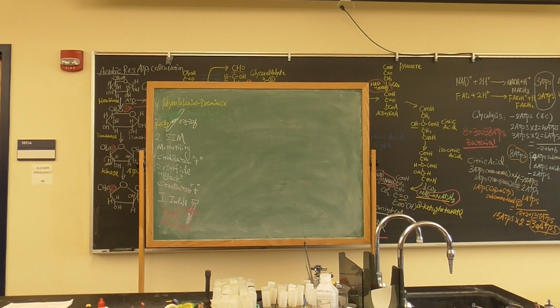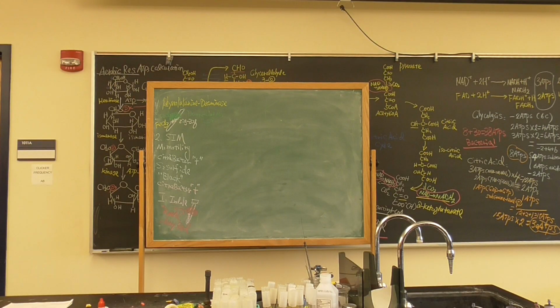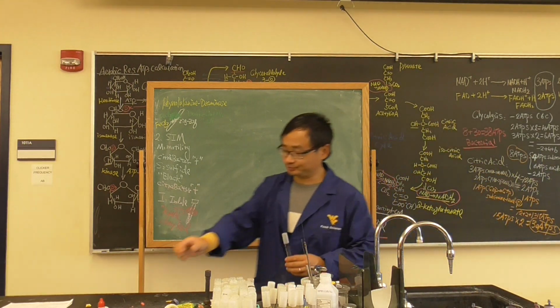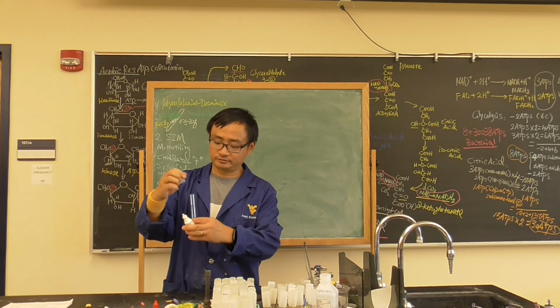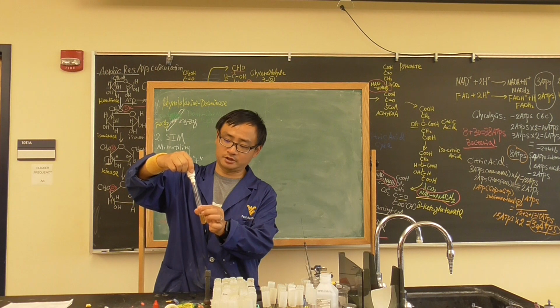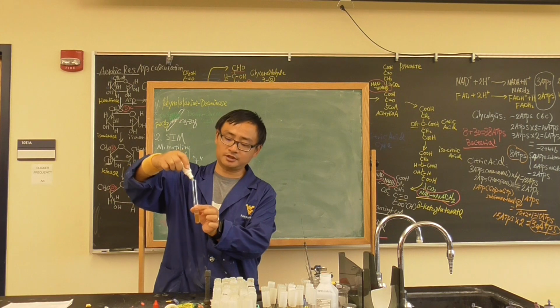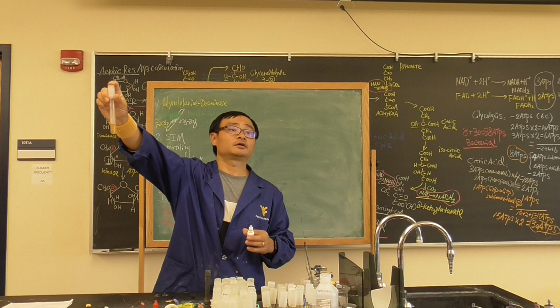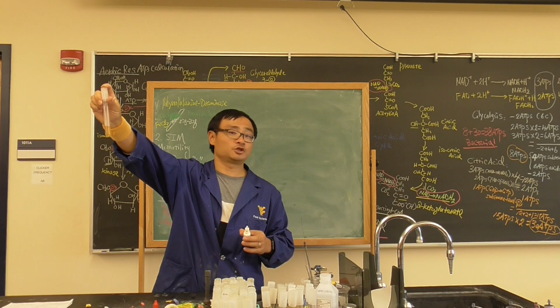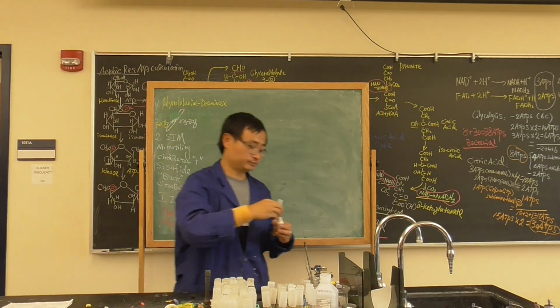Okay, let's see where the 10 points are going to go back. If it's there, it's there. Okay, shake it. Let's see what it looks like. So we put in 1, 2, 3, 4, 5, 6, 7. See, look at the color change. 10 points back, okay? Cherry red. Indole test positive, it's E. coli. Absolutely E. coli. See? Really good job.